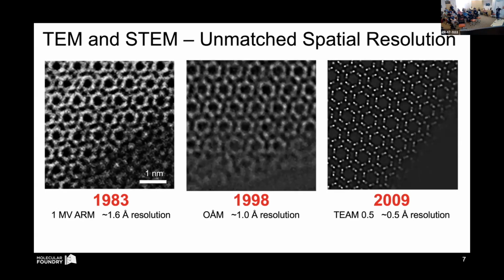So if I zoom in, you can sort of see the different generations here. And you can see why aberration correction was so important to us. It basically only gave us about a factor of 3 to 4 increase in resolution, but the average bond length of most materials is somewhere in the 1 to 3 angstrom regime. And so getting down to half of an angstrom allows us to see that each one of those blobs, which is a silicon column and a nitrogen column, are actually 2 separate dumbbell structures there. So you can see the hexagonal silicon nitride sample, it's Si3N4, and you can even see the bridge nitrogens, the two A sites linking the edges of the unit cells there.